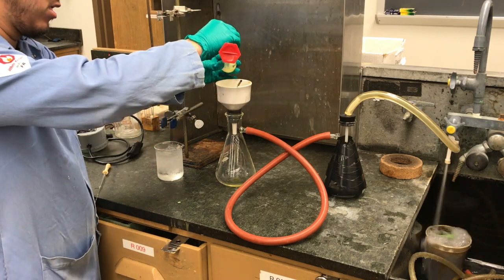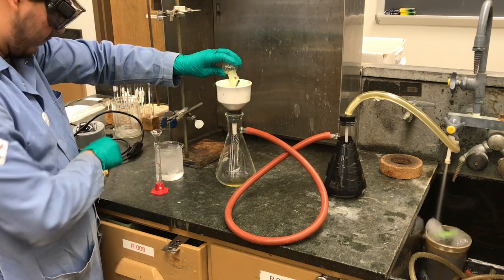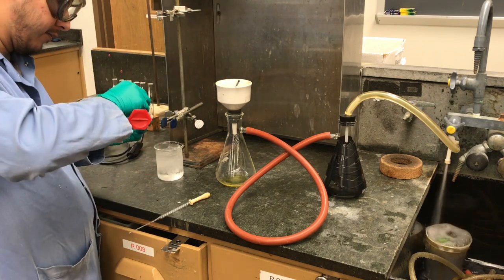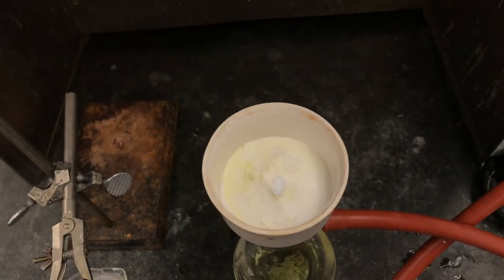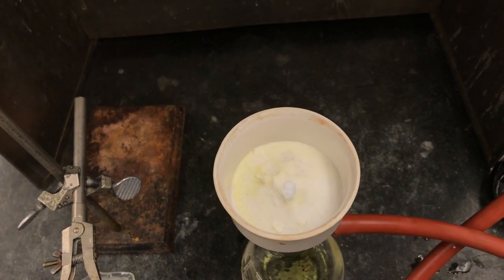So I'm just going to add about 2 milliliters of ethanol, kind of rinse that, try to get more of it out. Another 2 milliliters. So here's a close-up of what the solid looks like, and you can see there's still a little bit of yellow spots on there.